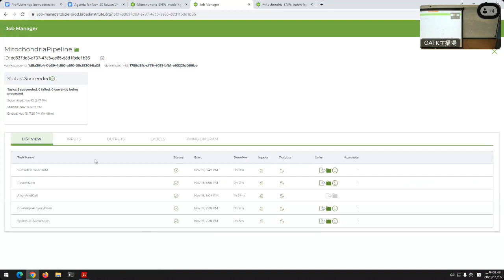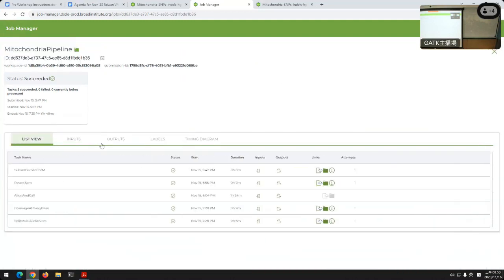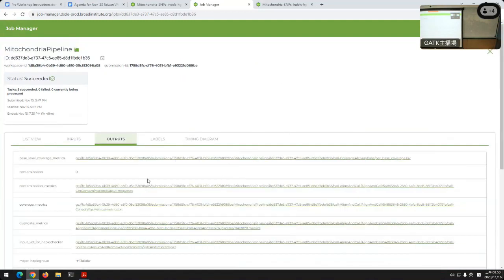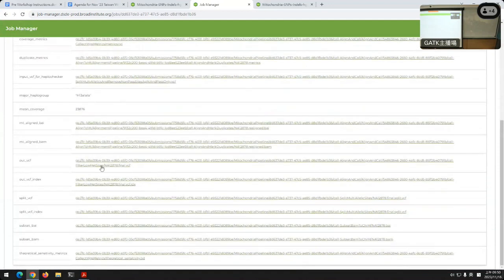When you look at the data, you can see a lot of what's going on, all the individual tasks that were in there, and the inputs passed. You can actually check per task. Outputs, for instance, here's everything the pipeline spit out. You've got your output VCF. Remember I mentioned the really long and weirdly named Google buckets that Terra makes for you. You can see that, the FC blah blah blah. That's the spot in your Terra bucket where it dropped it. Don't worry, you'll never have to know that, but you can see it here in the outputs, okay?